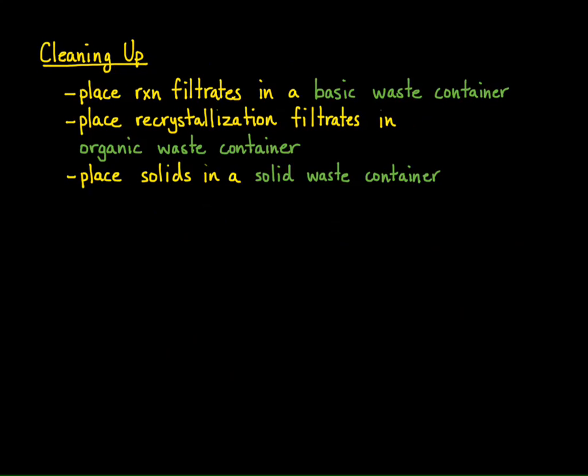When you are finished with the reaction, make sure you clean up properly. Place any reaction filtrates into a basic waste container, any recrystallization filtrates into an organic waste container, and all solids in a solid waste container.